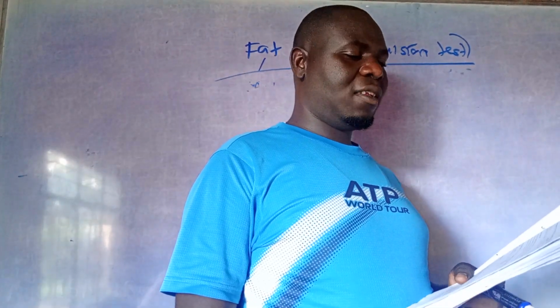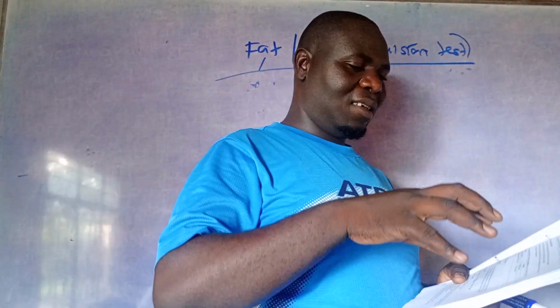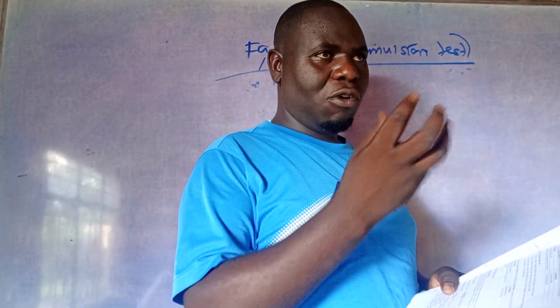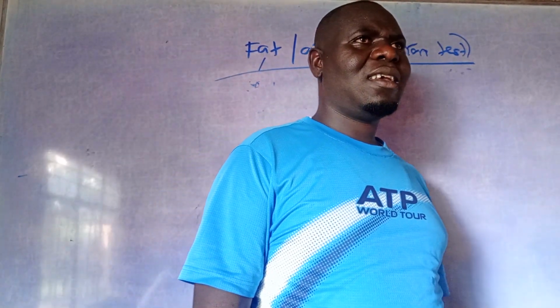Grease spot is absent. But if it appears, forming a permanent grease spot or oil, then grease is present. It is hard.